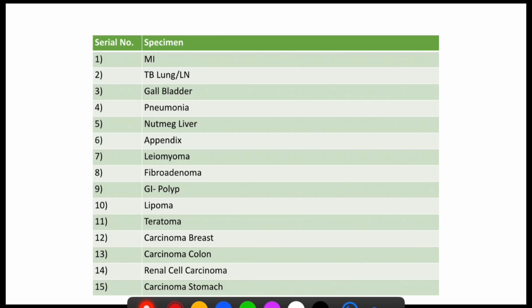So I hope now you will be very happy to see and identify gross specimens when you go to the practical exam.